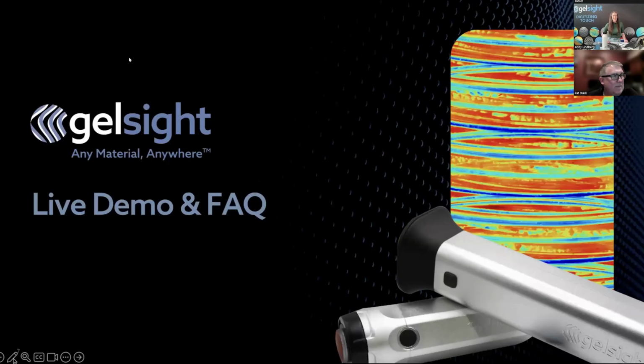The first one is, can GelSight pick up a 1/1000th of an inch deep dimple on a mirror? Yeah, so that's not going to be a problem for the GelSight system. We talked about the pigment layer here, so we can look at it regardless of the optical properties. We're not going to have that problem with the reflectivity.